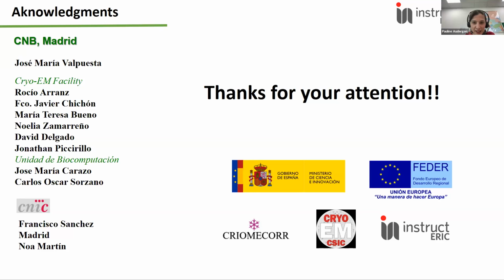Thanks. We have a new question from Bruno Claros. Do you see issues with non-amorphous ice using the EM ice instrument? Tested lamella by diffraction, calculate Fourier transform? Actually, for the high pressure freezing experiments, we just measure them by cryo-FIB-SEM volume imaging. We didn't prepare lamellas out of high pressure frozen samples and measure them in the cryo-electron microscope.